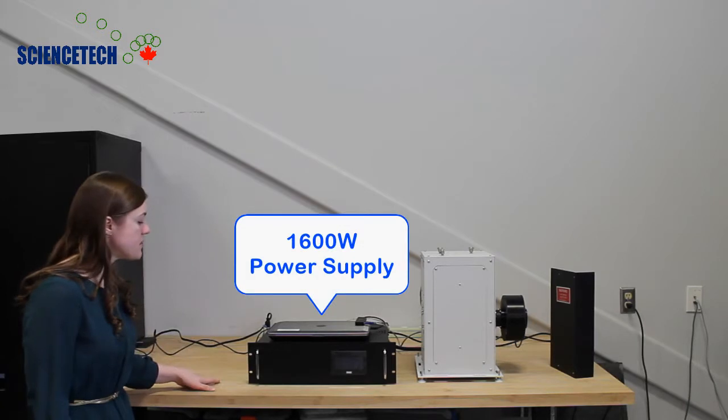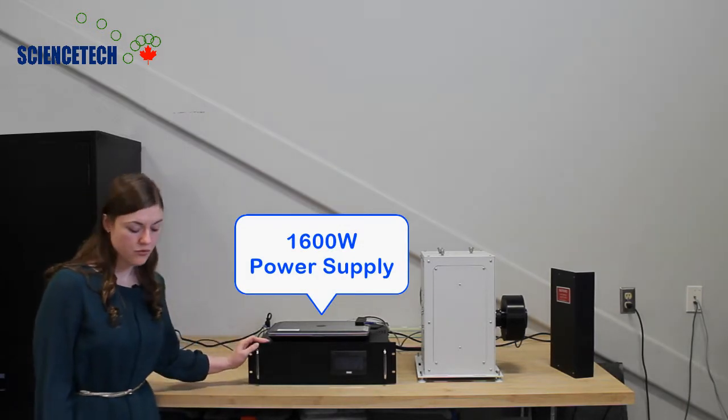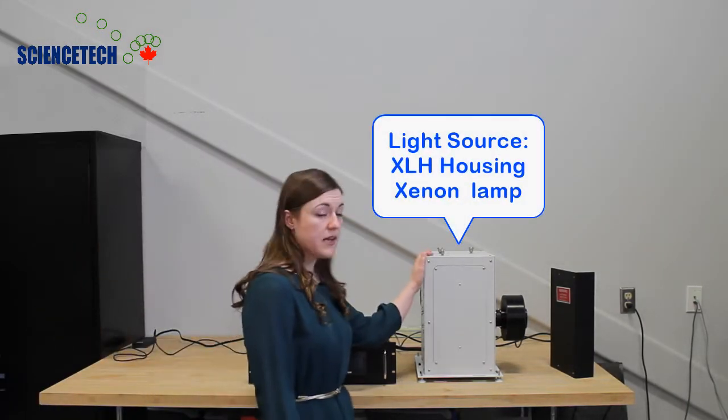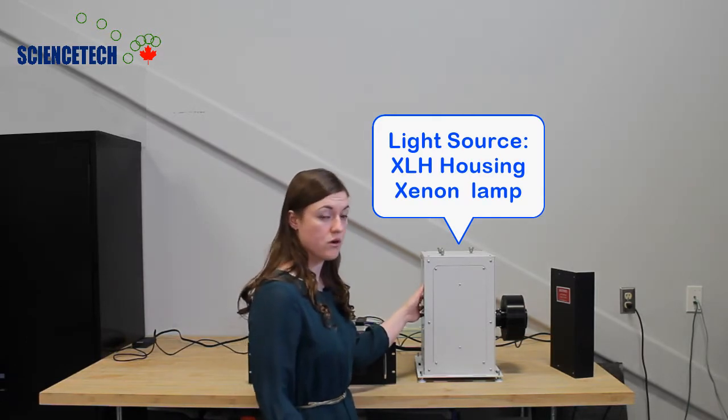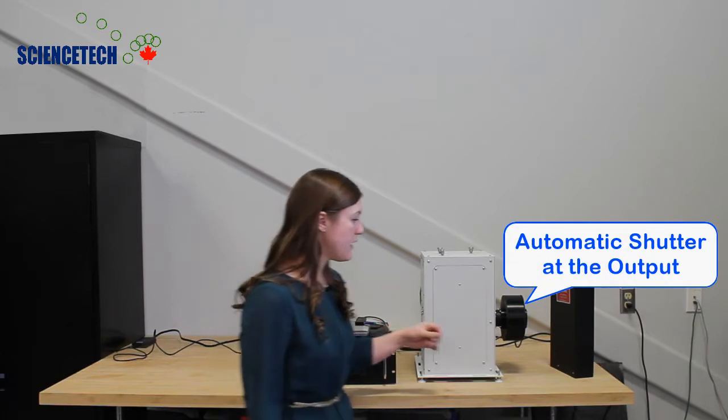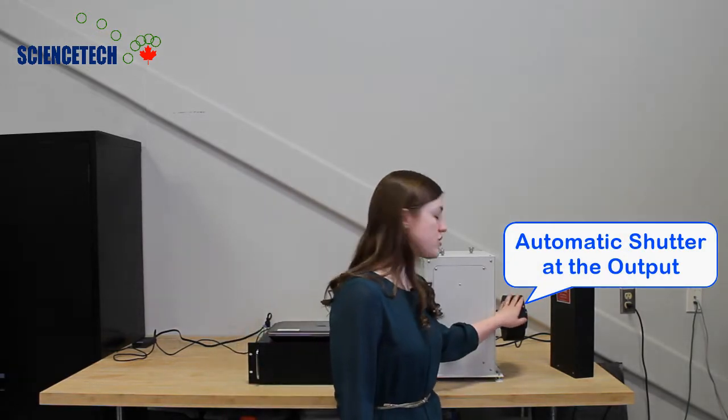The light source consists of a 1600 watt power supply as well as the XLH housing, and inside we have a 1600 watt Xenon short arc lamp. This system also has on the output an automatic shutter as an accessory.